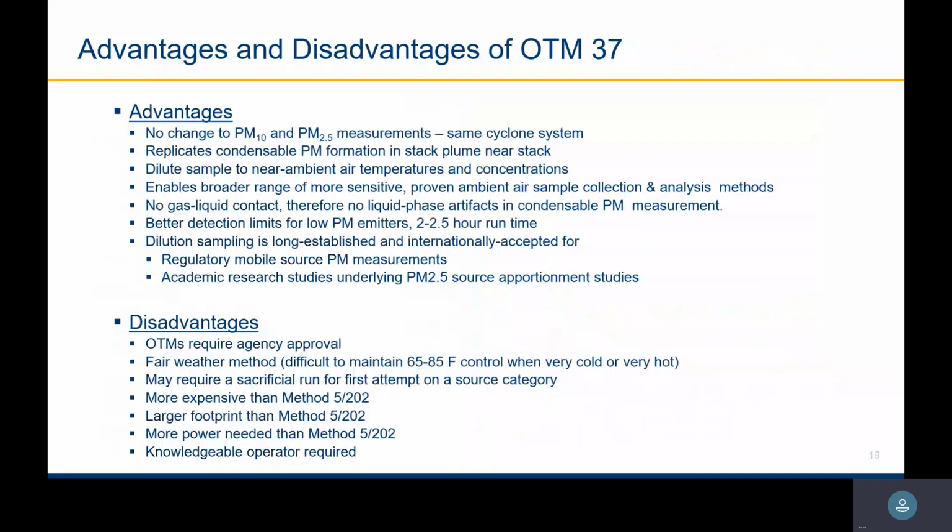For the recovery and assembly of the train, we typically have a person dedicated to that on the job site. Whereas with 5202, that would be a shared responsibility that someone would do between test runs, and then during the test run, they would have another duty and be able to do something else. So this does take a little bit more manpower. It's more equipment, it's larger equipment. There's a little more electrical power needed.